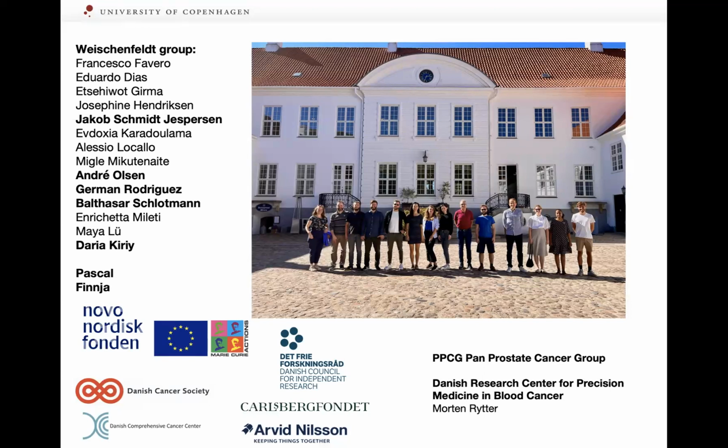And that's also what we're finding, that Sniffles is probably the one that performs the best right now, but it's definitely not perfect. I think there's also something with the alignment, which also needs improvement. So we typically use Minimap2 with default parameters, but I think there's room for optimization. And then of course, it becomes an n squared number of combinations, the more you add. But I think we need to identify a couple of variant callers, because it's still a very active field, and we just heard Manuel working on another variant caller, right? I mean, especially the indels are a huge issue. So yeah, I would agree, we can't rely on a single caller.